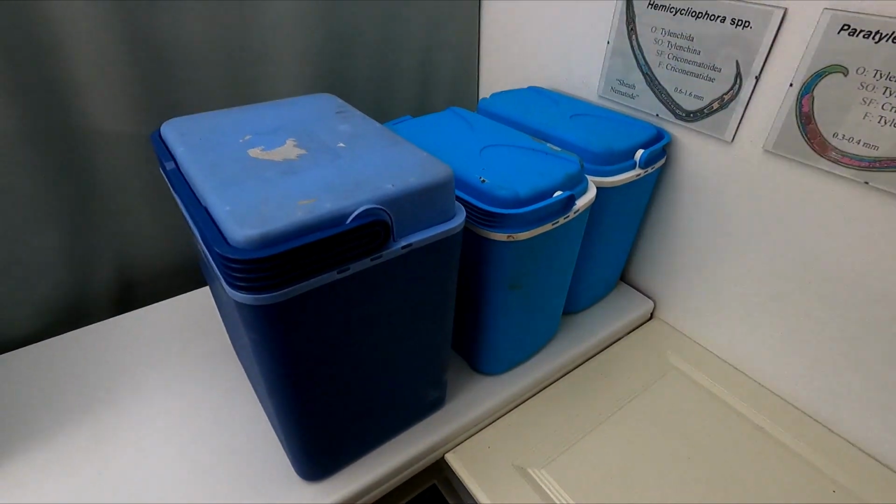Now, I'll leave a link to a recent video I did showing how to sample your soil for microbiology, but the purpose of this video is just really a quick guide. If you're collecting multiple samples, I'm going to show you what I do when I'm collecting a few samples, just to keep them as fresh as possible so that before I get them to the laboratory, they're in the best condition that they can be and are as representative as they possibly can be in comparison to the soil, the situation, the environment from which they were removed. So we'll get straight into it.